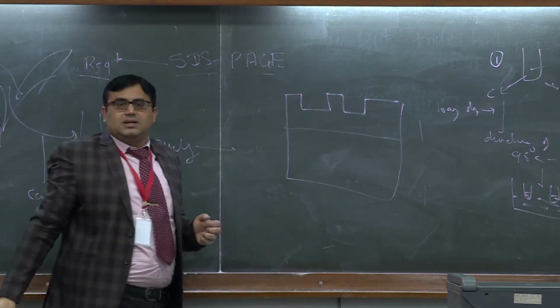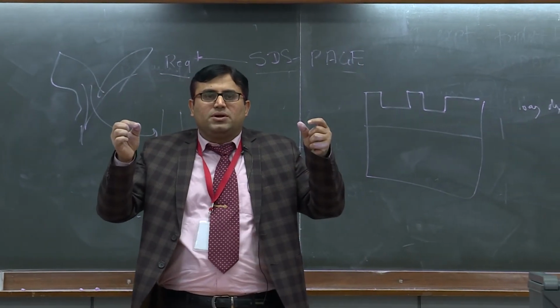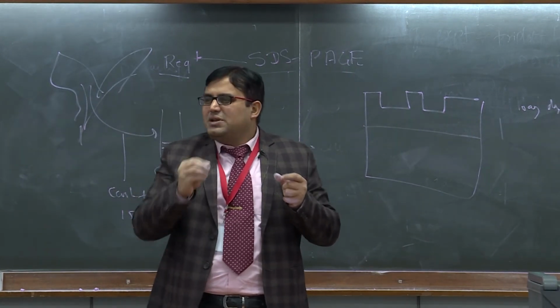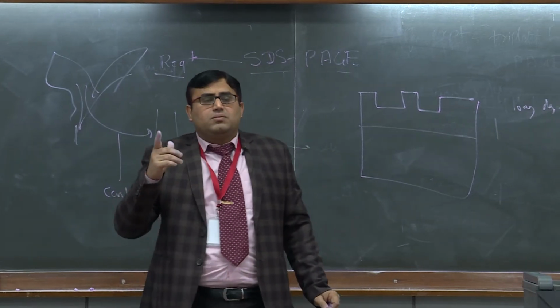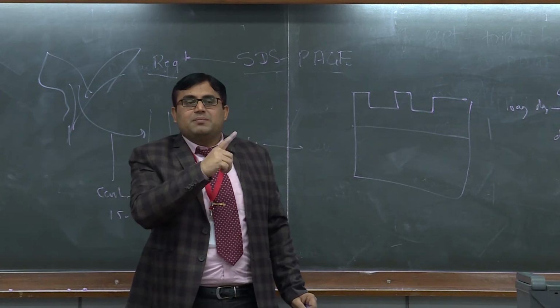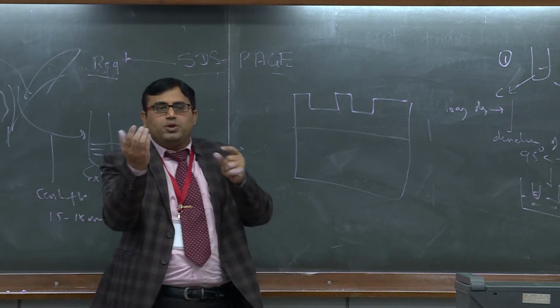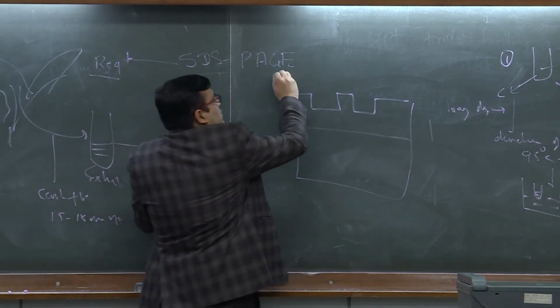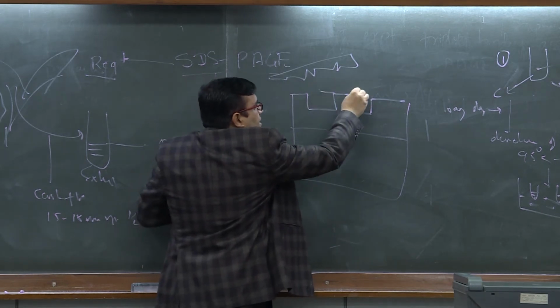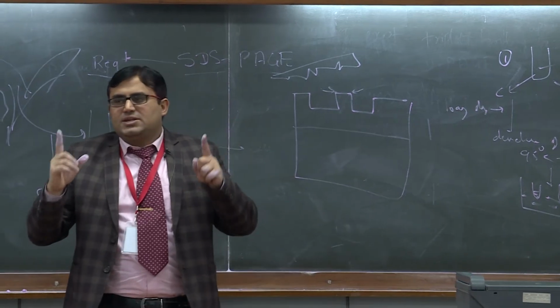Now this is the gel. Many times it happens that when you take the comb out, your gel will start displacing, or many remnants will be there. A person is not supposed to load sample unless you clear the remnants and make it straight. Easily you can do it: you can turn the comb, and from the back you can make it straight. All your walls should be straight when you are running SDS-PAGE.